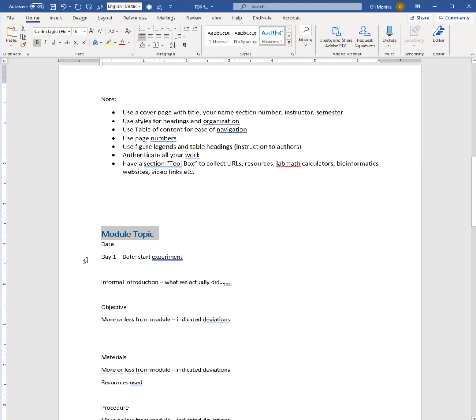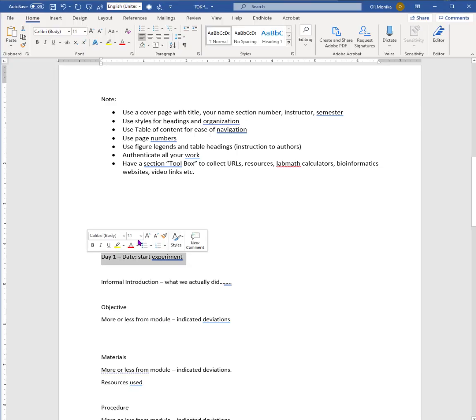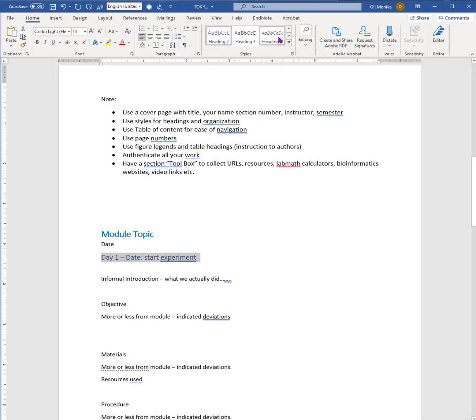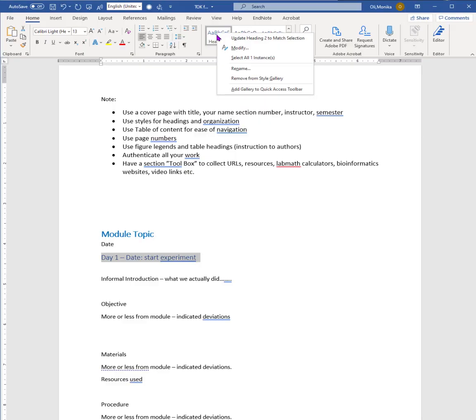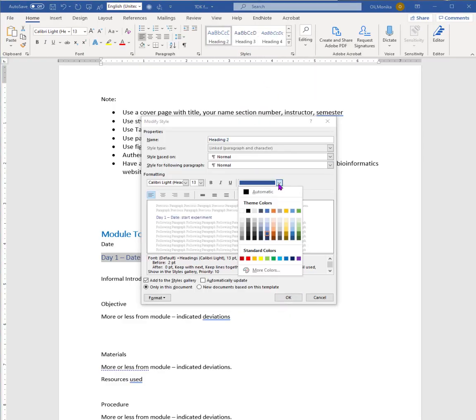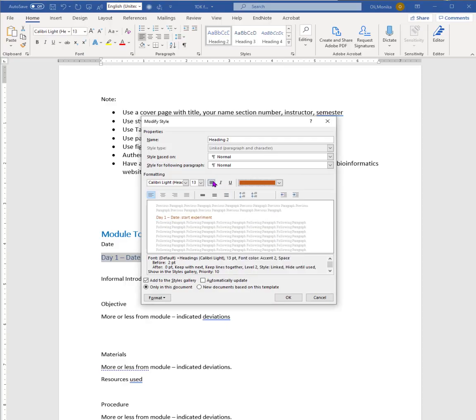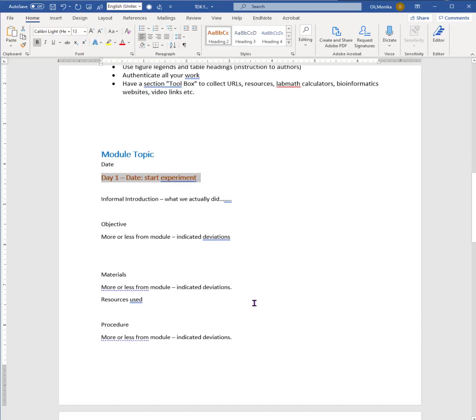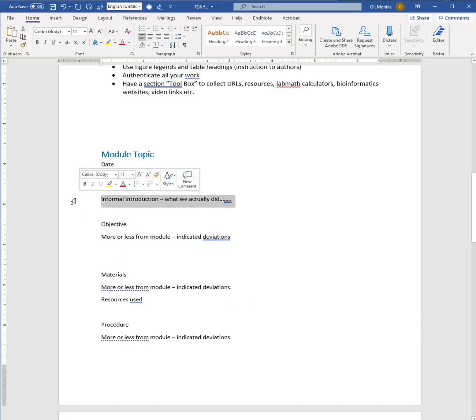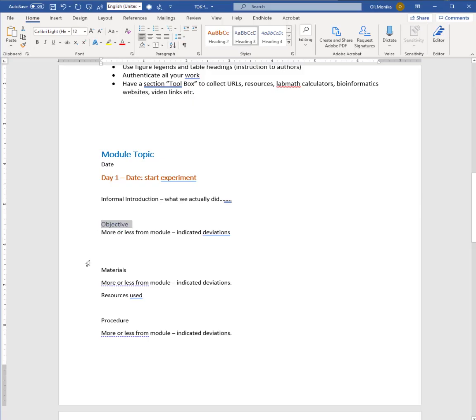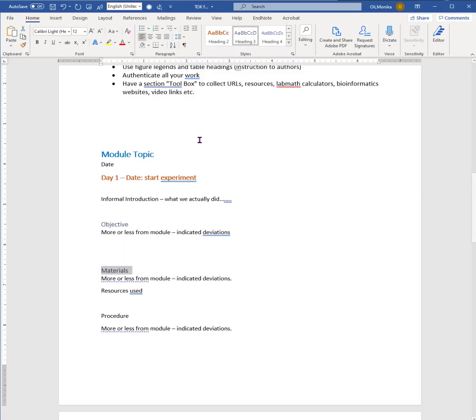Now we'll probably do the days or the different segments of the experiment as title two. Again, let's make our title two orange because we are here in Gator world. Make it bold and you see that it will stay now the same way. And an objective, informal introduction - you can give that title three. That's gonna be the same thing for each section: materials, procedure.